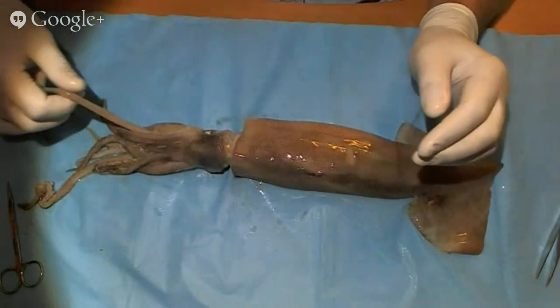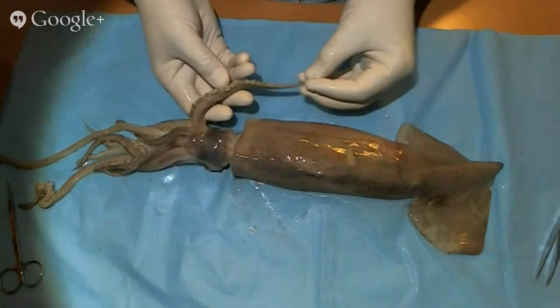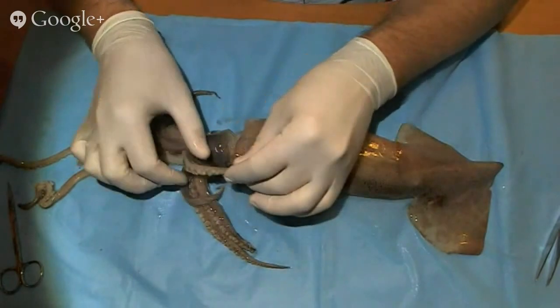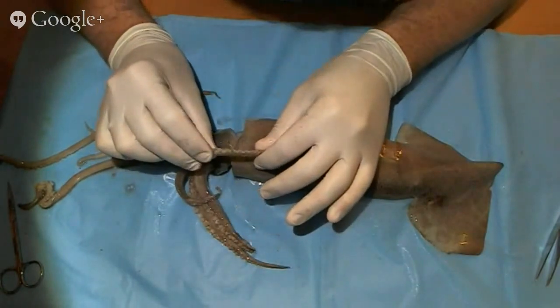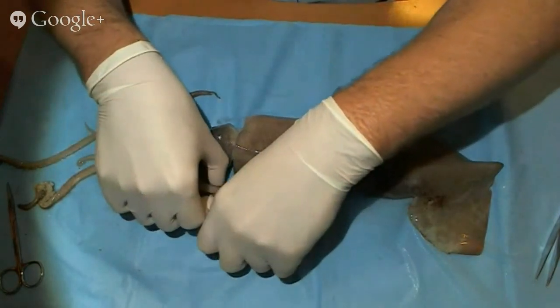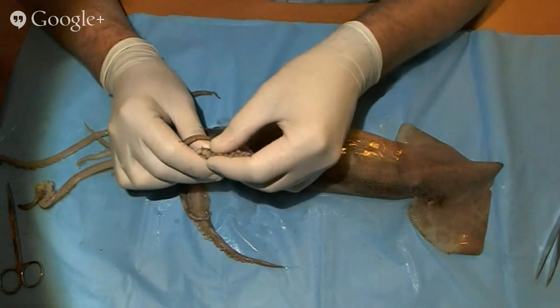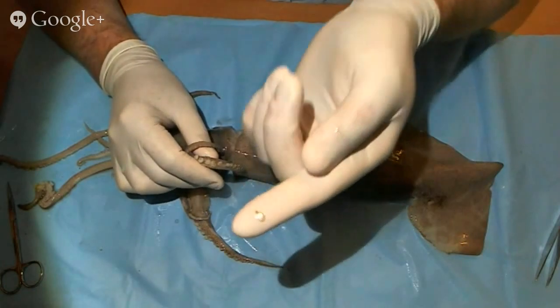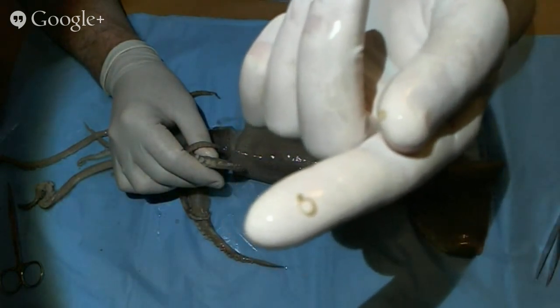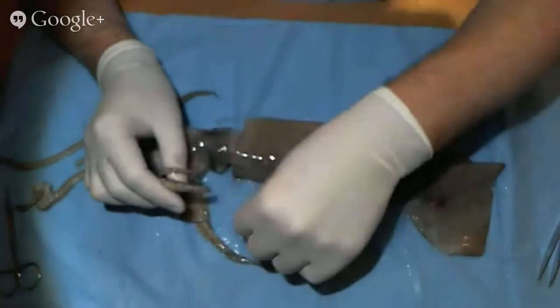All right. So then we point out some different things. Ask kids maybe count the number of legs or the number of tentacles, and they might notice that there are 8 tentacles that are small and have suction cups all the way along. And you would ask them too, what are some of the things that you see with the suction cups? Now, certain squid, especially a big squid like this, if they touch these suction cups, then they'll notice that they're very hard, and they actually have these little teeth rings that are inside of there. And I don't know if this will focus on it right here, but I have a microscope view of it for you in a second. So there's little teeth rings that are inside each of those suction cups.